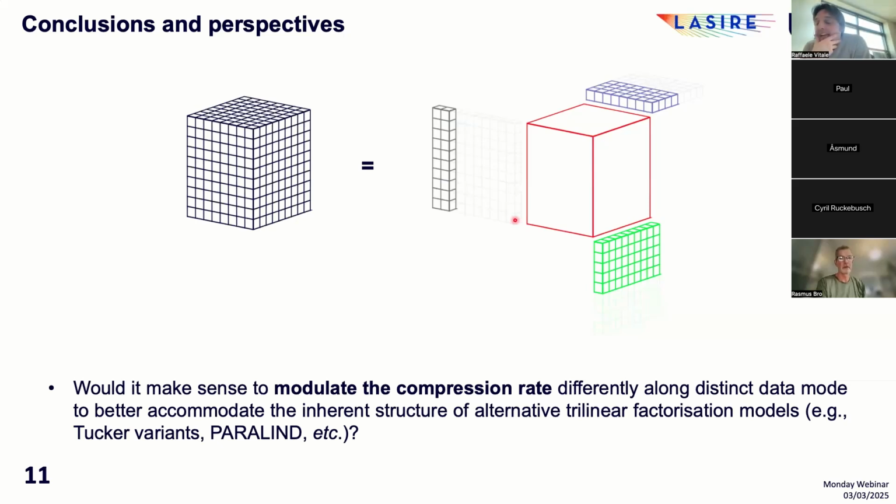This is something that we did previously in bilinear curve resolution. We weighted the resolution based on this convex peeling approach, and this robustifies the estimates.